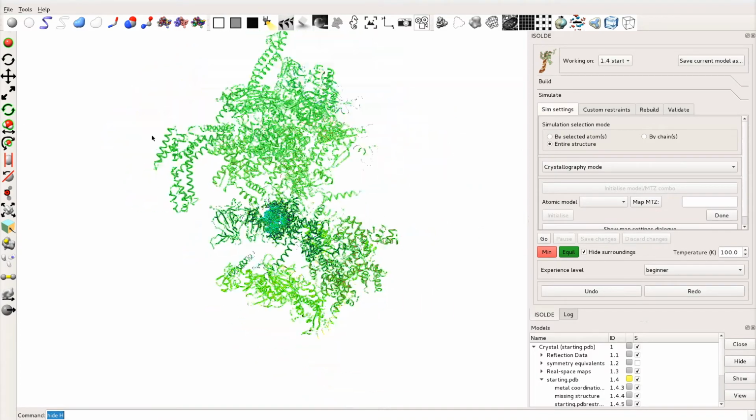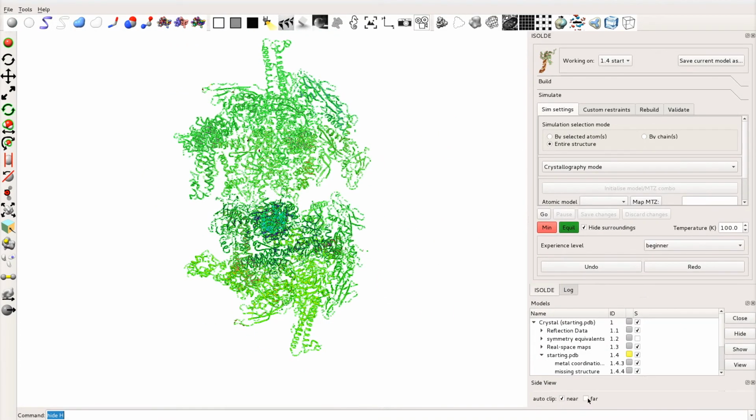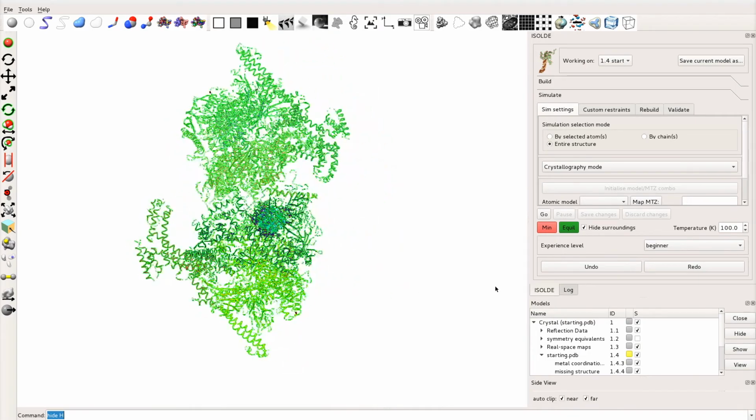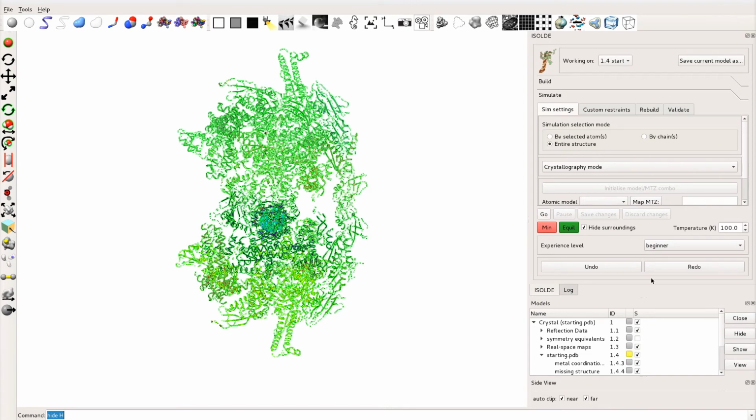Before we go any further though, it's generally a good idea to give the entire structure a good settle and re-refinement and generate some fresh maps. This serves multiple purposes. First, it relaxes out any truly bad clashes which can generate energies of millions of kilojoules per mole, which would otherwise crash any simulation. Second, it tends to fix many small errors on its own, and reduce the ability of big errors to hide in collections of lots of small outliers. Third, it lets you choose a nice conservative refinement strategy to reduce the likelihood of overfitting the data.